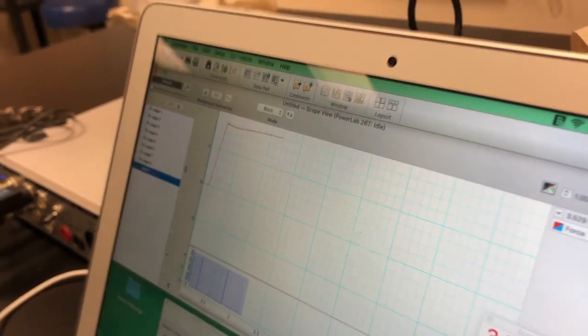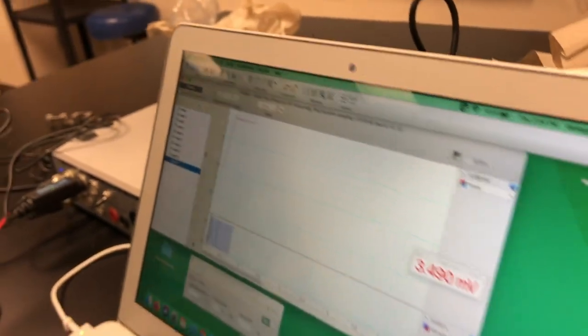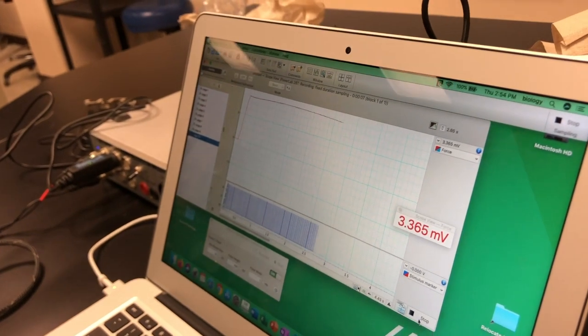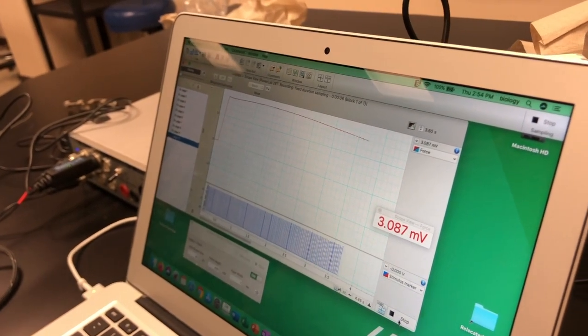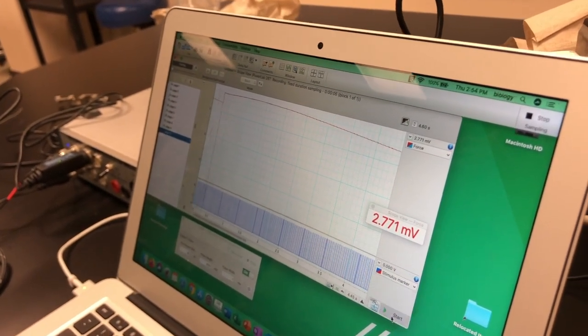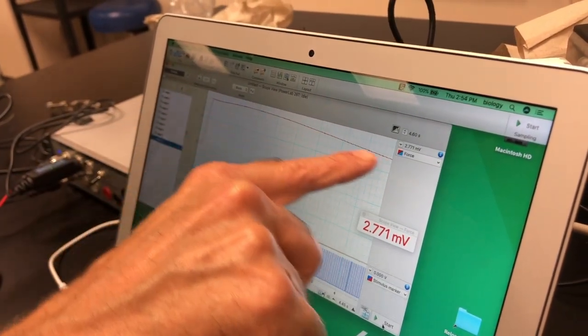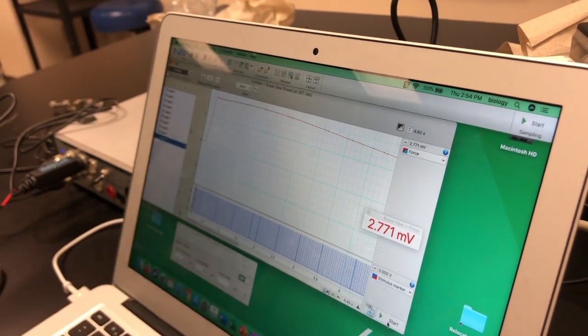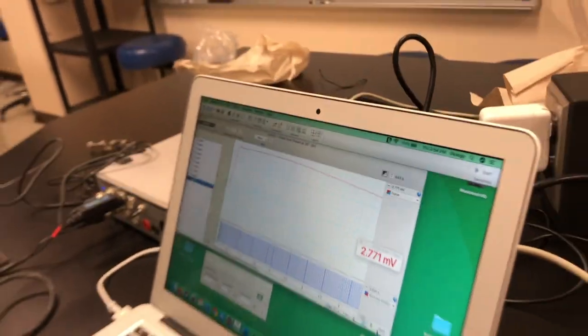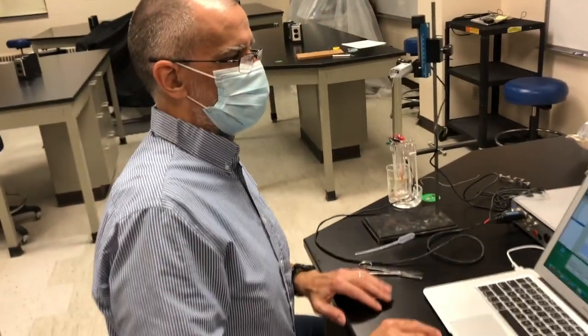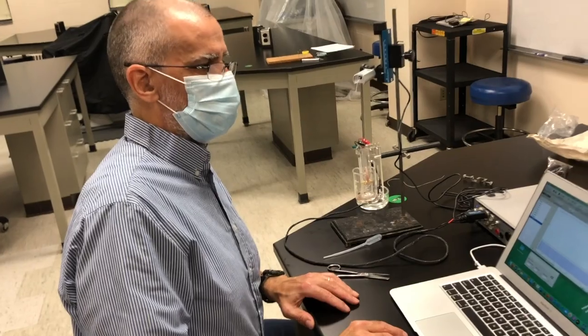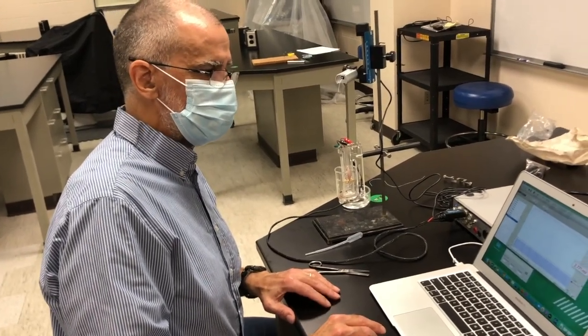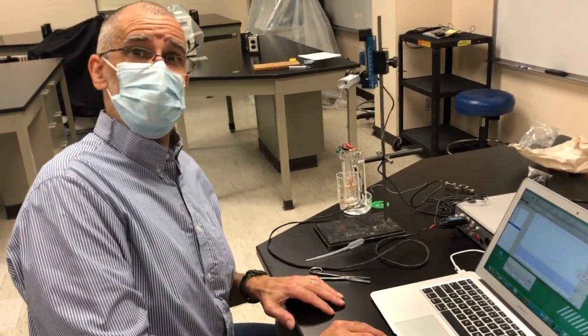Now watch what happens if we let that go for a while. See how the tension drops off? That's called muscle fatigue. And we will talk a little bit about muscle fatigue in class. That's it.